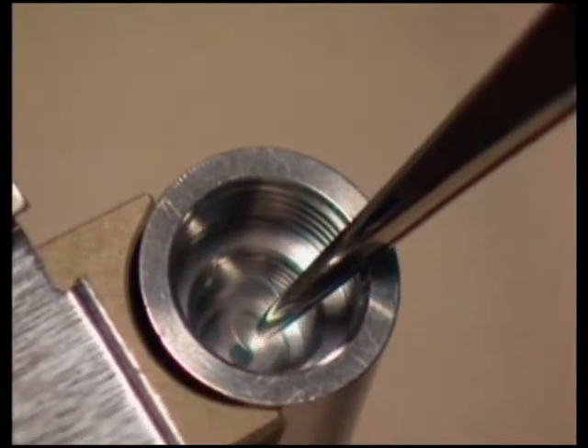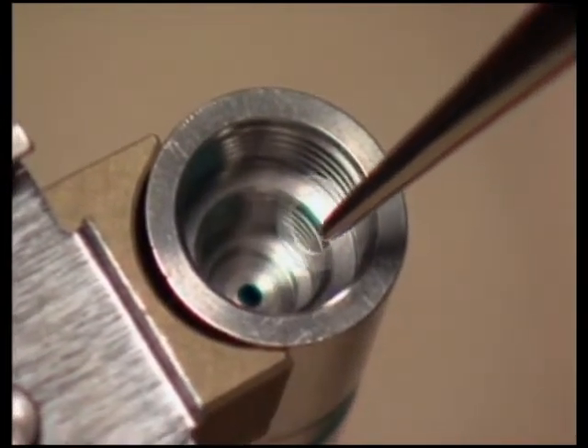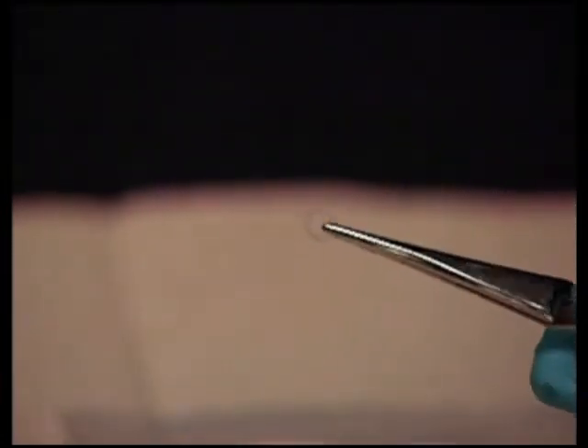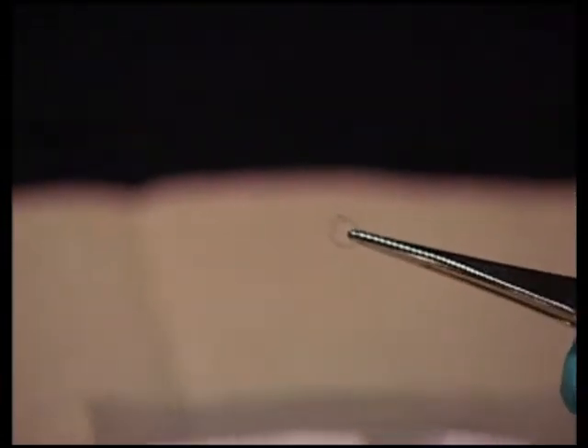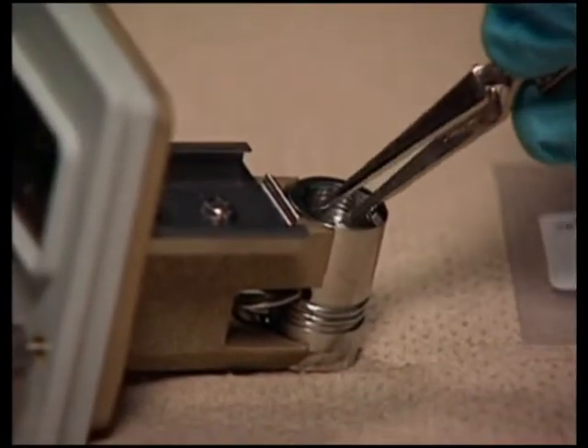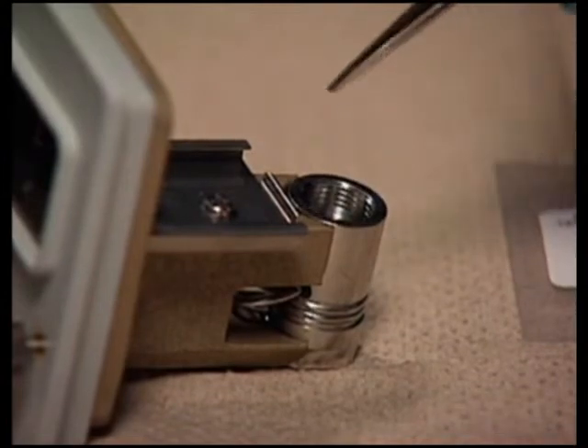Remove the clear plastic gasket. Using the tweezers, remove the new gasket from the flow cell gasket rebuild kit and inspect it for cleanliness. Drop the new gasket into the groove at the bottom of the flow cell body. Be sure the gasket is inserted properly.